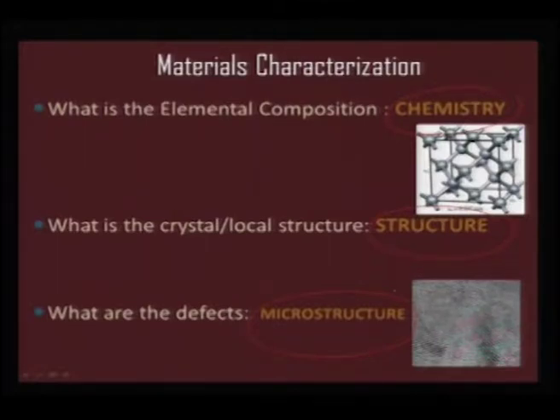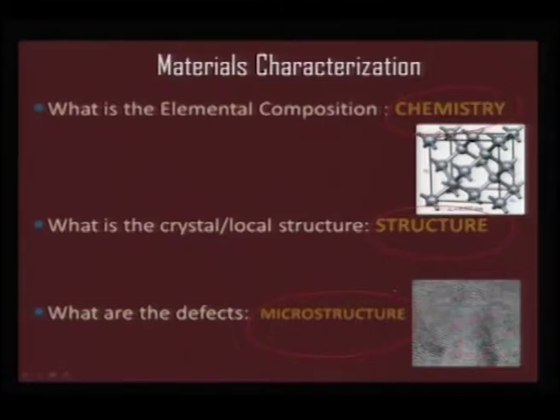In today's talk I will first be talking about almost the first invention among imaging tools, that is the scanning tunneling microscope, which brought a new focus into material characterization, because until 1986 SEM and TEM were the only tools popular for studying the microstructure of any given solid.